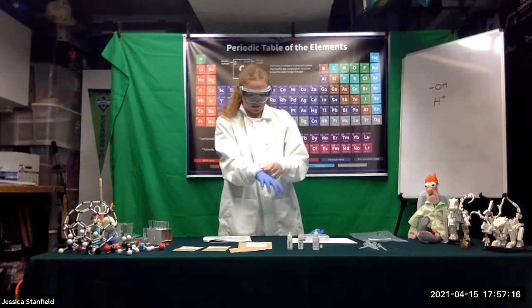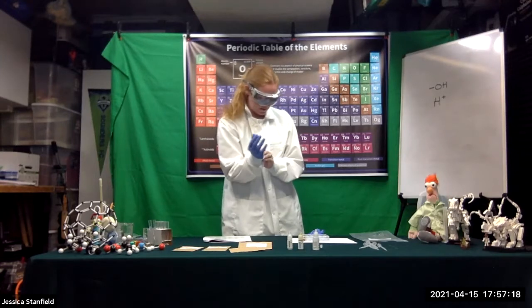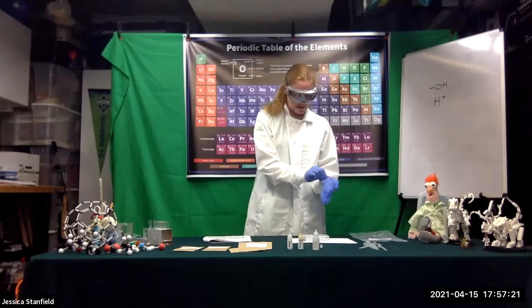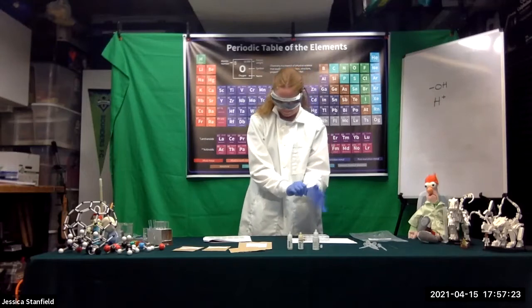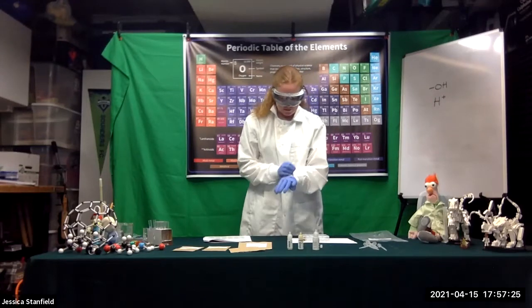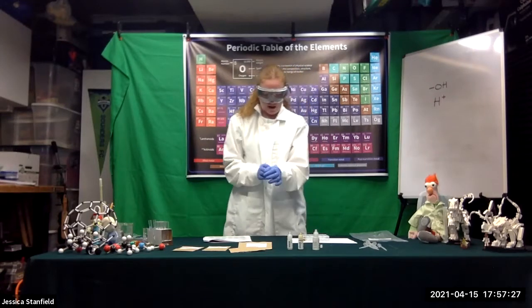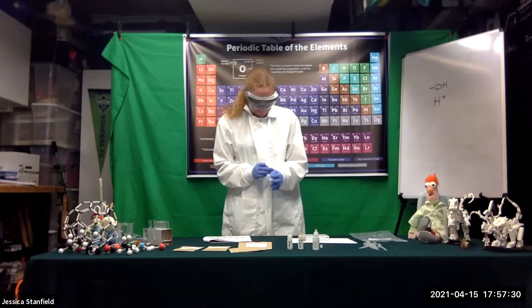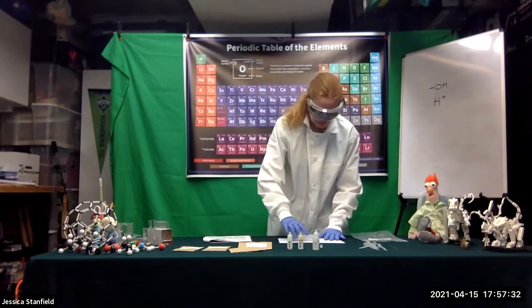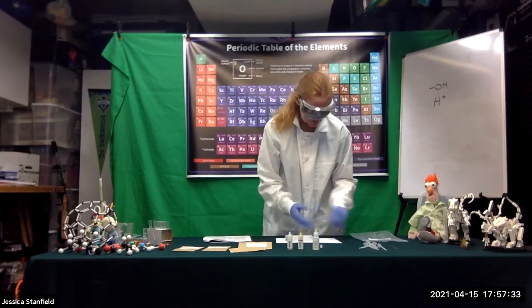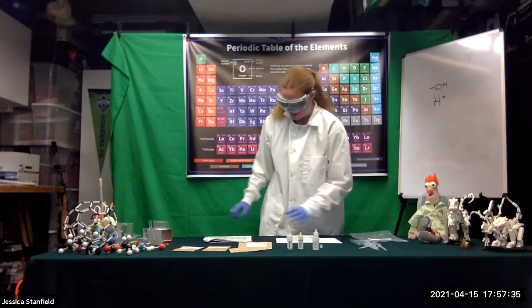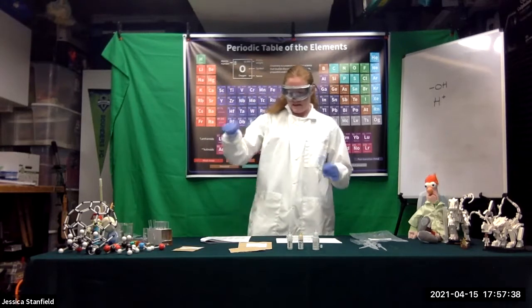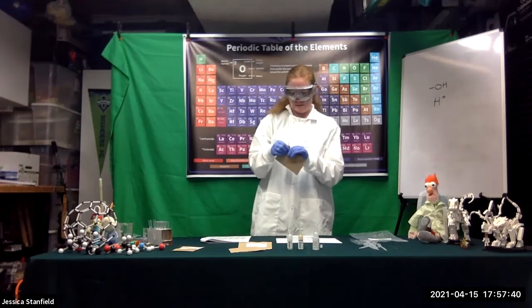Okay, so we're going to first look at our known compounds. In our first two wells, we're going to add the solid salicylic acid and solid acetylsalicylic acid. I'm going to shake down my envelopes and tear them open. I'm going to use my spoon to get out one mini spoon of the salicylic acid and put that in well A1.